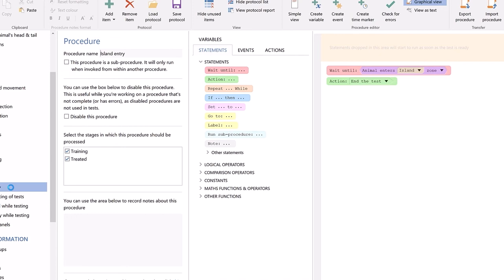That's it. You can see that there are lots of other things that could be set up in this protocol page, but almost all of them are optional, and in one single protocol, you'll probably only use a few of them.